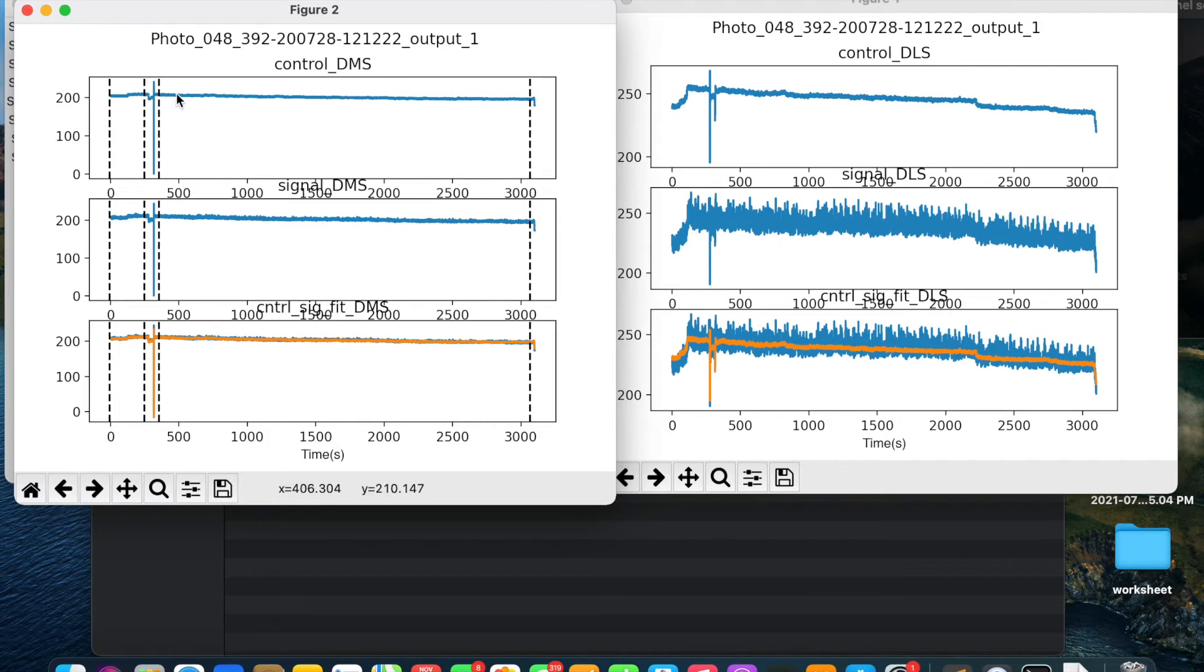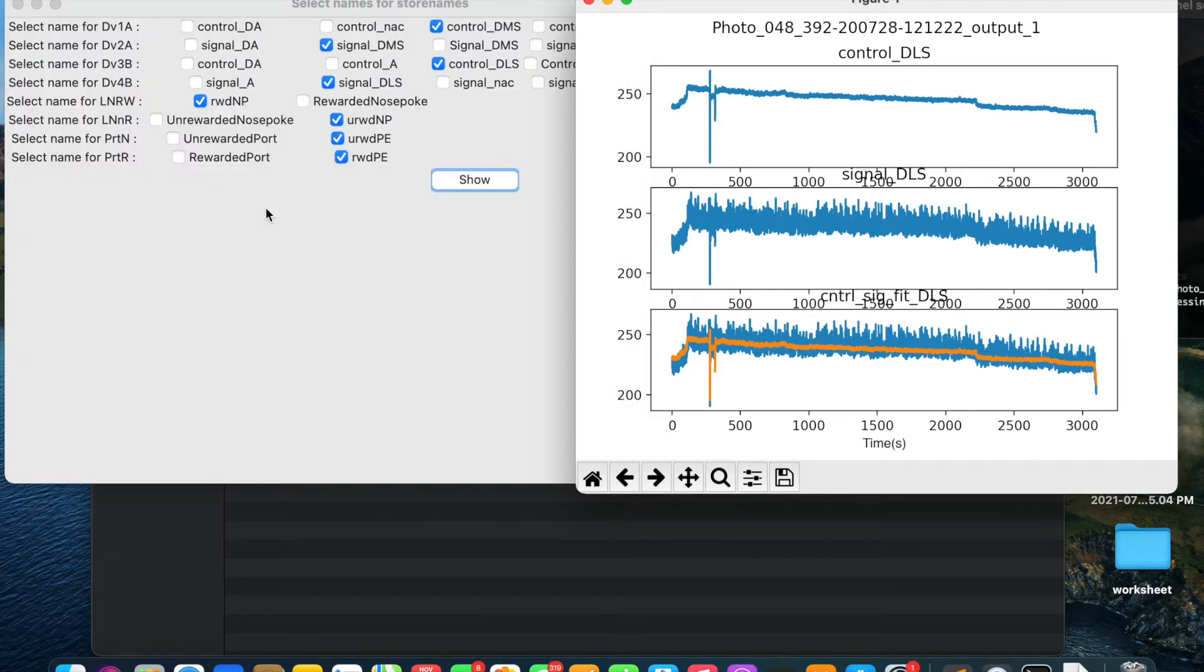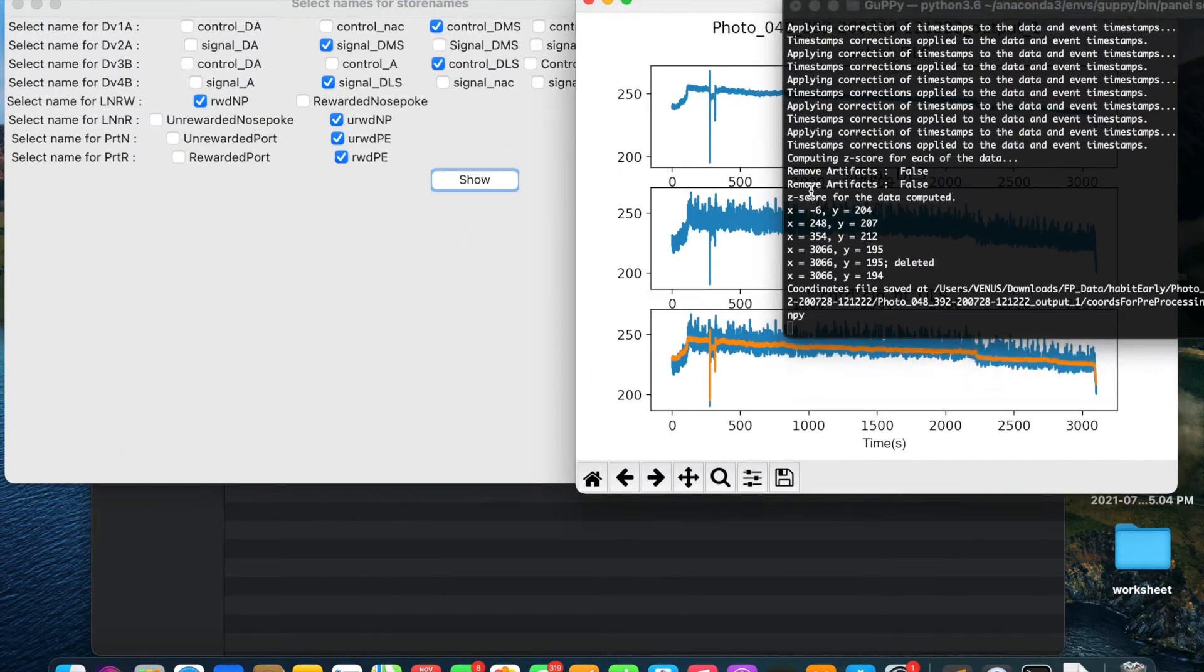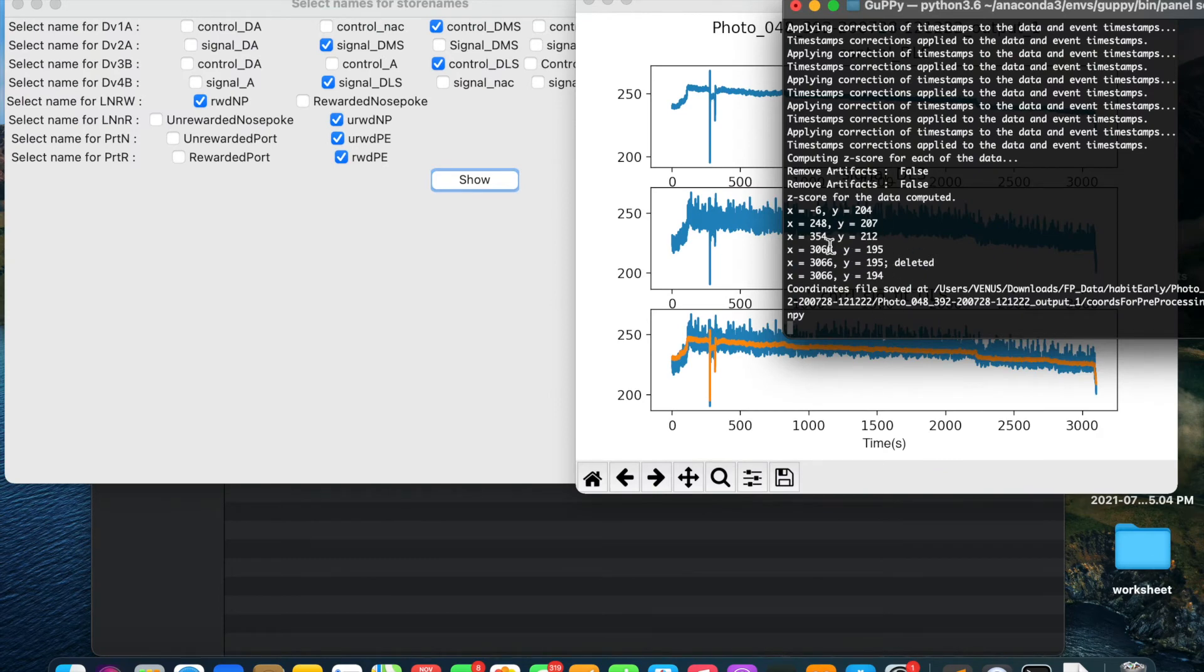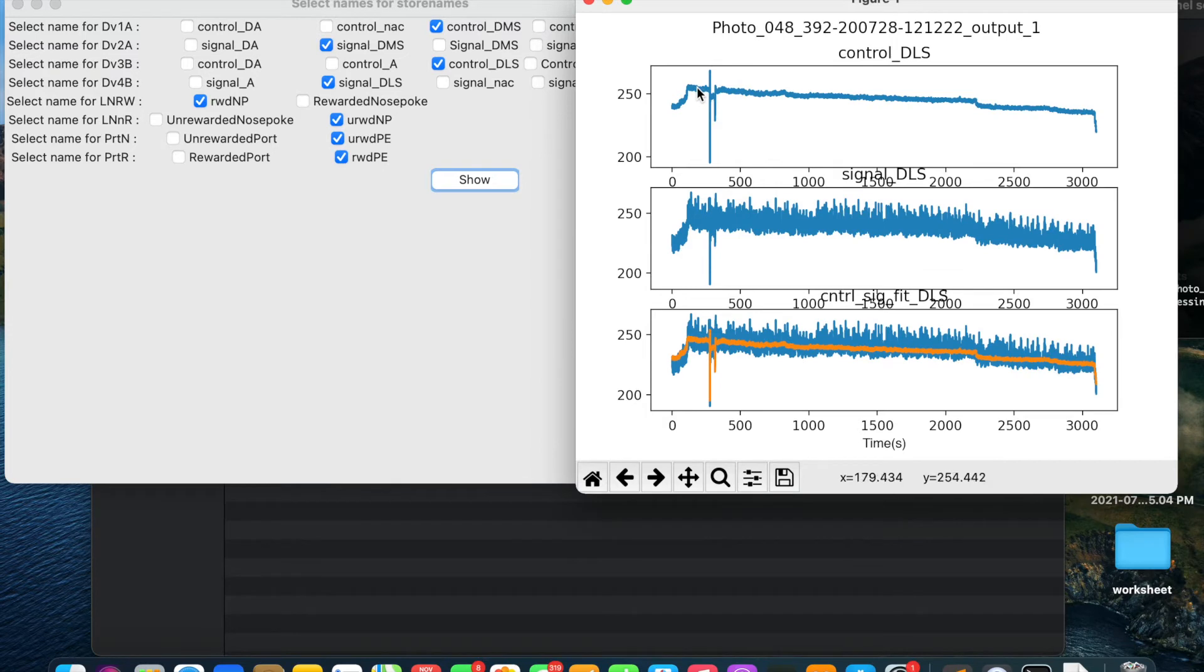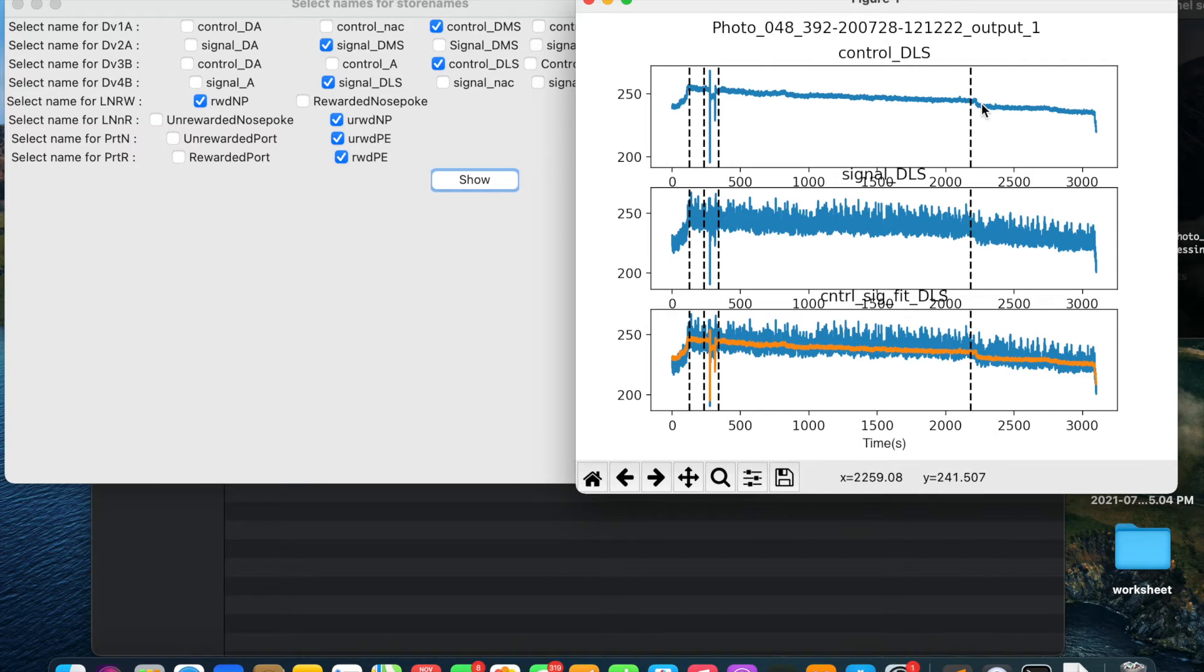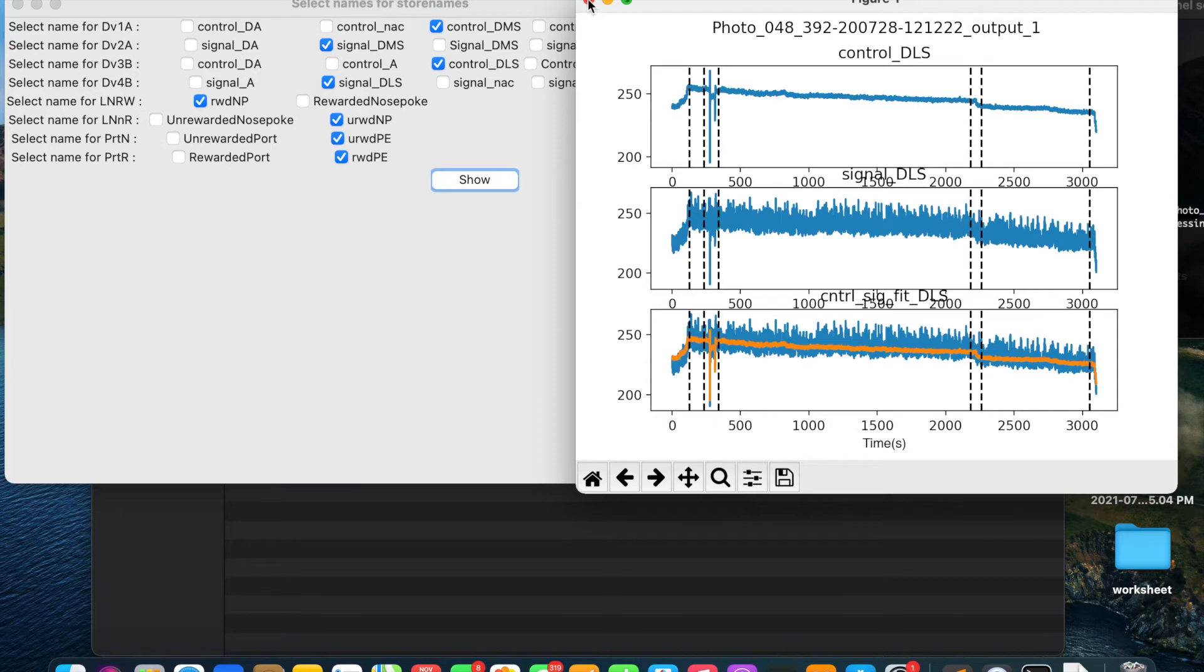After the selection of coordinates of points are done for each chunk, close the window and the coordinates will get saved into a file. You will see like this on the terminal. I will do the same process for this data. I will select the chunks which look good and then close this window.